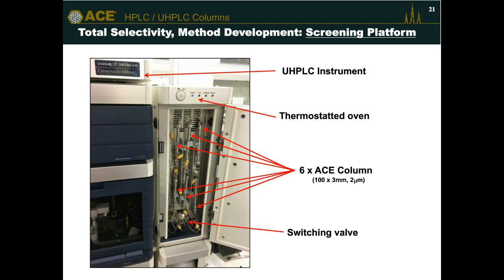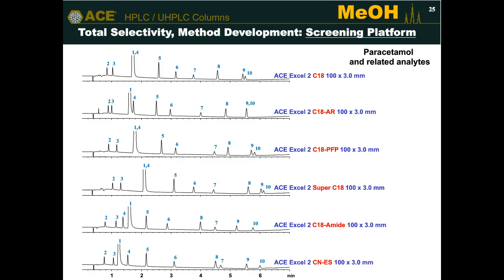Someone asks some questions about some of the examples you presented. How do you do peak tracking for the 10 compounds during screening runs? So in this particular example, as I mentioned earlier, we were asked to develop this related substances method, but we knew what all 10 compounds were. So this is, in many ways, as I've said a couple of times, an easier example because we had all of these species available to us individually. Therefore, we could run the individual components to make sure we identified the peaks properly. So that answers the question directly.